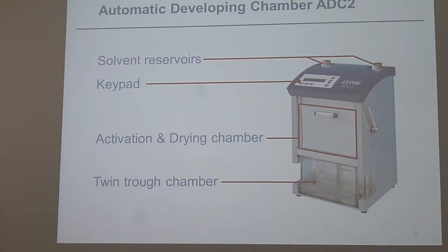Yeah, then you have to get a new one. They are specially checked so that there are no air bubbles in the glass, that they are clean, things like that. They are also measured. When you order, you have to specify it. Yes, exactly, it's a special number.